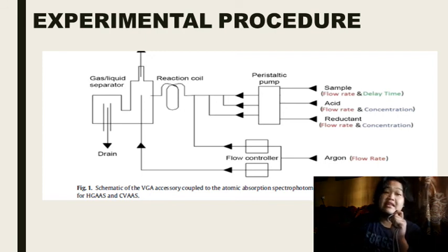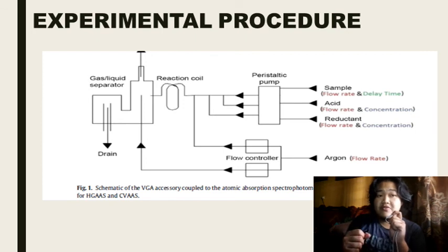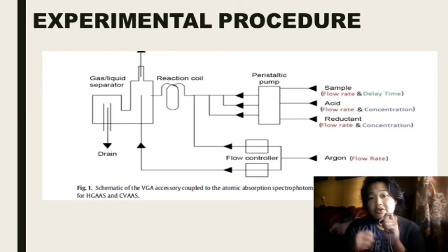And lastly, temperature of the acetylene flame was optimized for the atomic absorption spectroscopy by regulating the flow rate of the acetylene gas to oxidant. That's all from me.